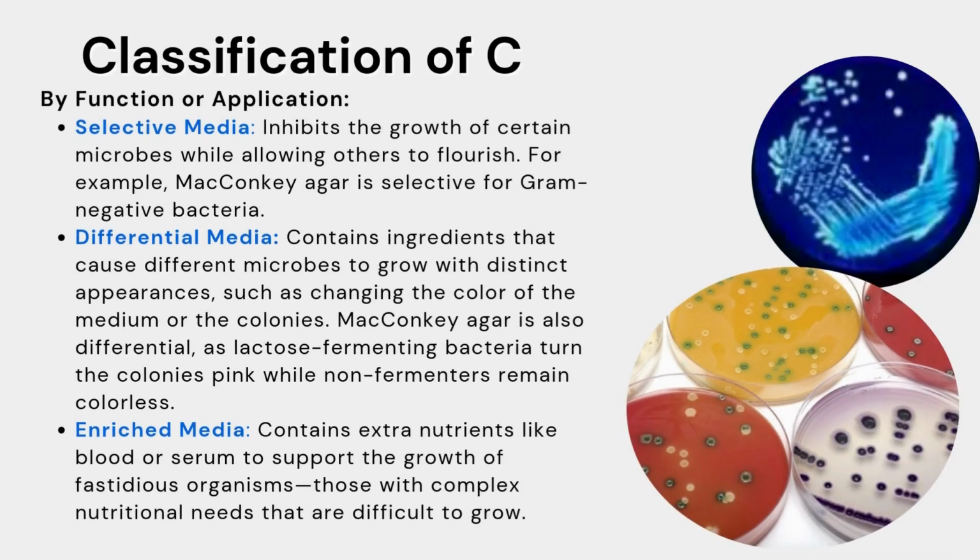Now the classification by function or application. The first one is selective media. Here it inhibits the growth of certain microbes while allowing others to flourish. For example, MacConkey agar is selective for gram-negative bacteria. The other one is differential media. It contains ingredients that cause different microbes to grow with distinct appearances, such as changing the color of the medium or the colonies. MacConkey agar is also differential, as lactose-fermenting bacteria turn the colonies pink while non-fermenters remain colorless.